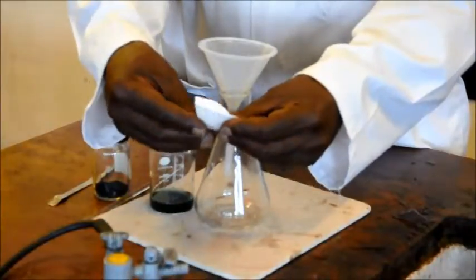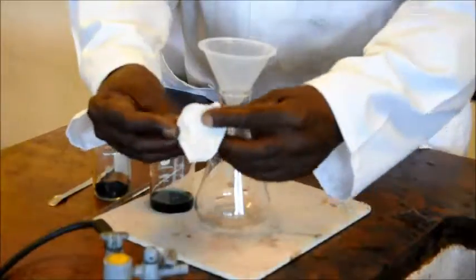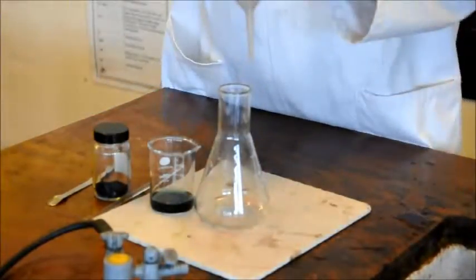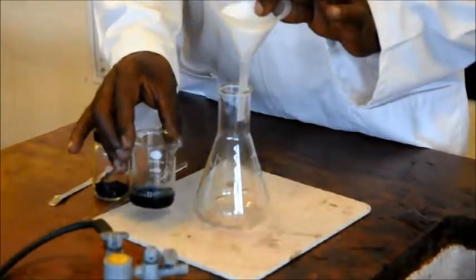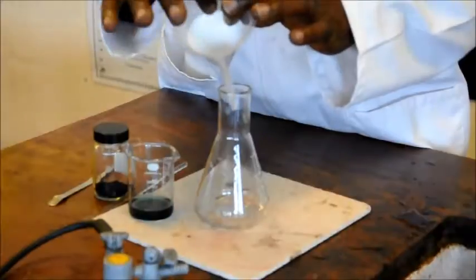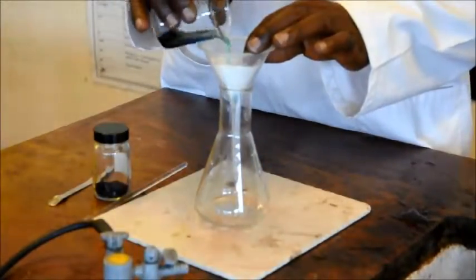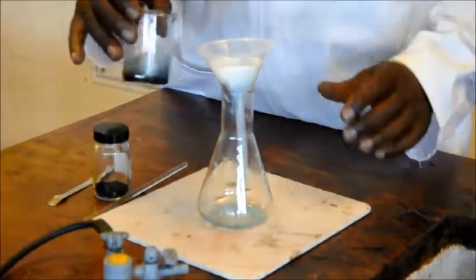And once I've got that, I separate one of the leaves away from the other leaves and pop that into the filter funnel. You normally use your finger to hold it in place, and then it's simply a matter of pouring the liquid into that part. Ensure none goes down the side. So in it goes, straight down the middle, get a bit of a swirl. And again.